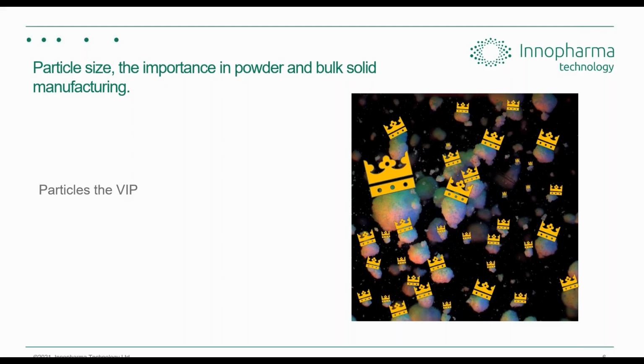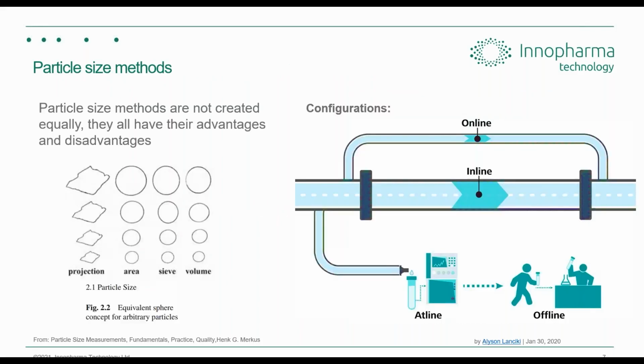Okay, so moving on from that. Little animation there showing that particle's king. Okay, so particle size methods. Unfortunately, there's not a one size fits all, and I'm sure there's a bit of irony in there as well. There are different ways to measure particles, and you will get different results.